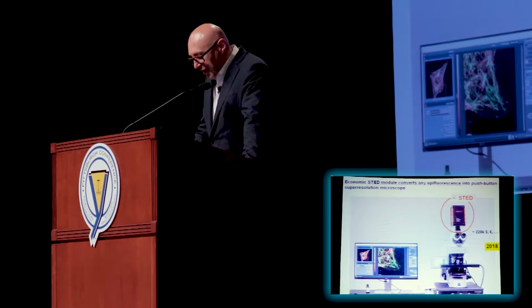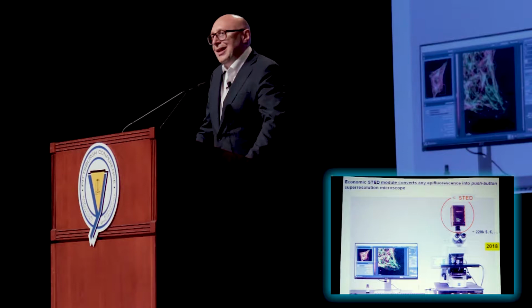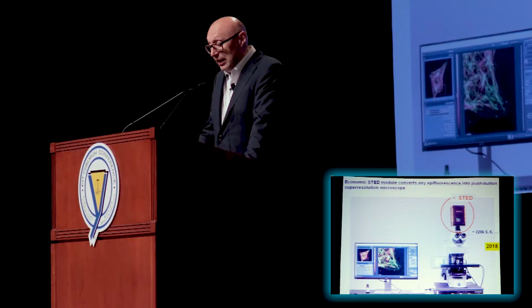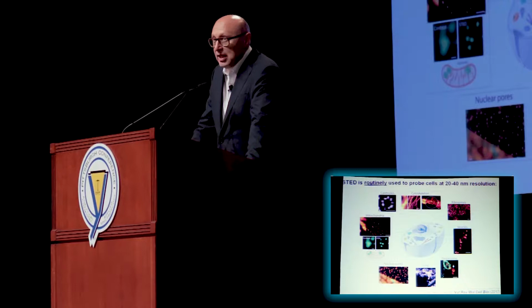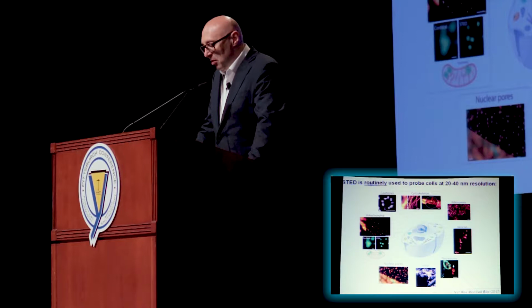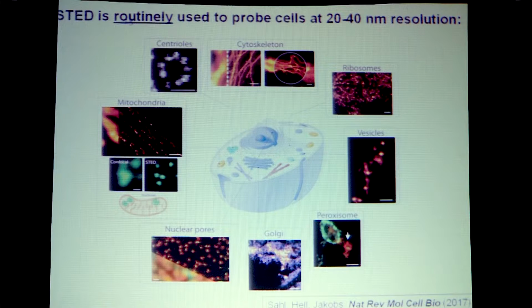And so what I'm saying by this is that the time where super resolution or STED microscopy in particular was complicated, difficult to use, is absolutely over, and now it's a push button technique that can be readily applied. As a matter of fact, STED microscopy has been applied and is being applied as we speak to all kinds of investigations in cell biology. I'm showing a picture from a very recent review that was published just a few months ago. And it shows a sketch of the cell.